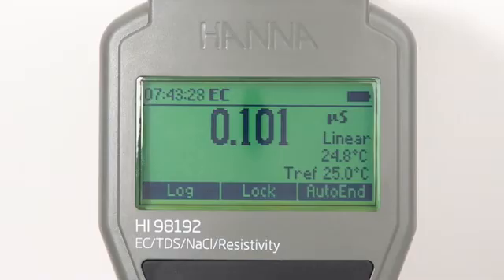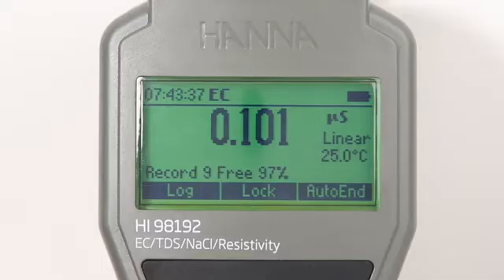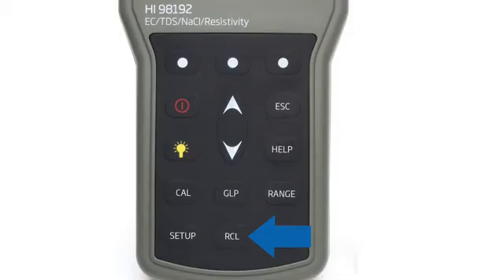With the log on demand feature, the meter can store 400 measurement readings by pressing the virtual log key, and 1,000 measurement readings when using lot logging at user-defined intervals. Stored data is easily recalled by pressing the recall button.